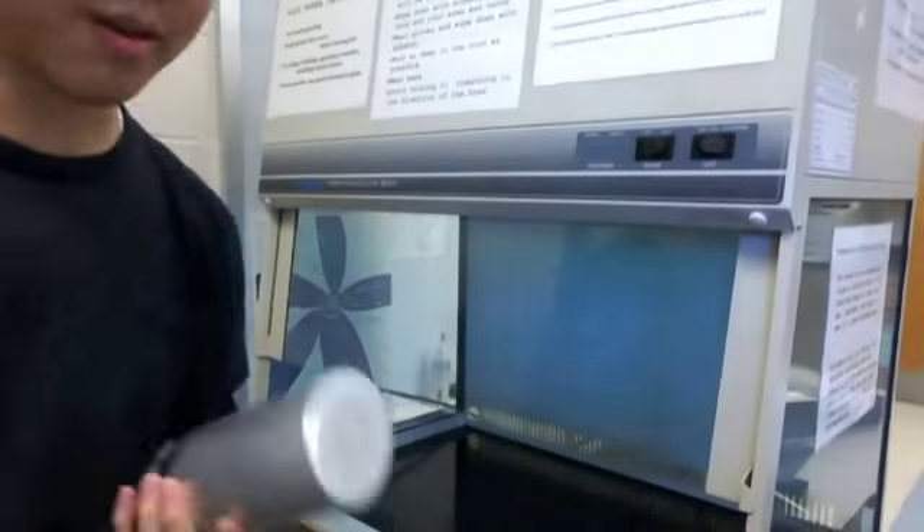I'm recording this after I actually did the testing, so I'm just going to explain to you guys what you're going to see. First of all, you're going to see this machine right here — this apparatus. This is called a laminar flow hood.